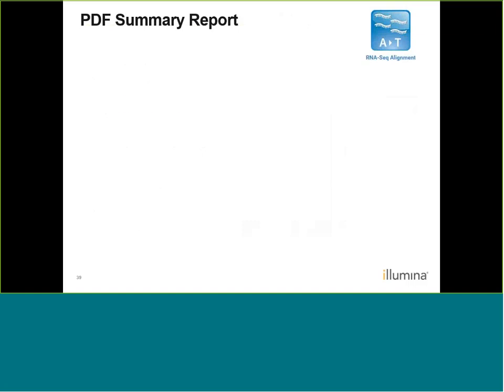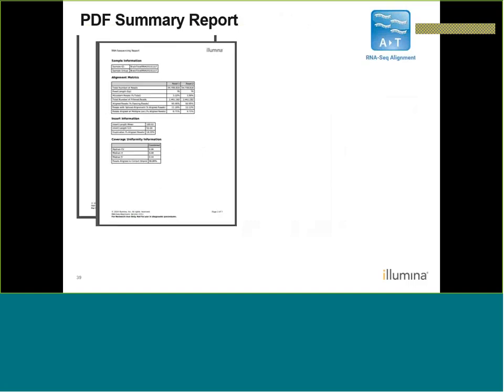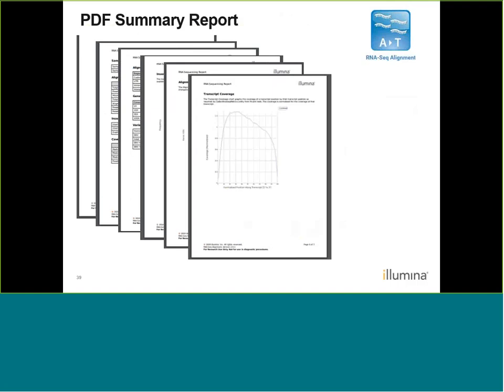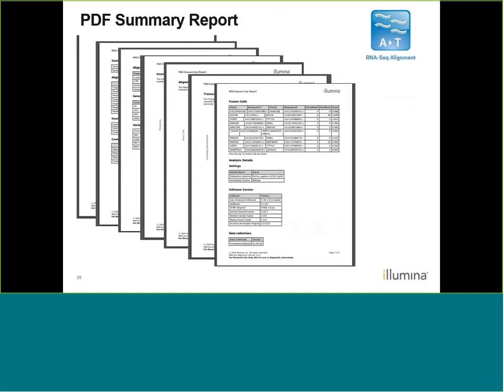Lastly, I just wanted to show you the PDF summary report that does get generated. This is a pretty comprehensive report, and it's going to use all of the main outputs and basically put it in this PDF summary so that you have a quick way of looking at a sample, or of looking at statistics for each of your samples.